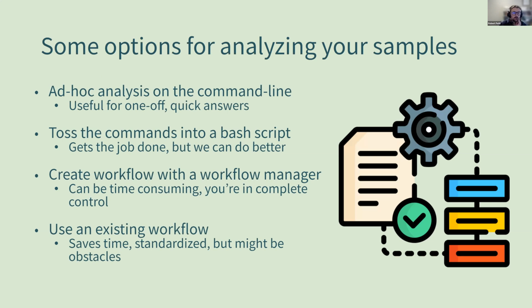Eventually you start using them more often. You may toss those commands into a bash script and it gets the job done. But I hope after going through this workshop, you're thinking, we could probably do better by using a workflow manager. And so the next step would be, hey, I'm repeating this a lot. How much can I offload to a workflow manager?